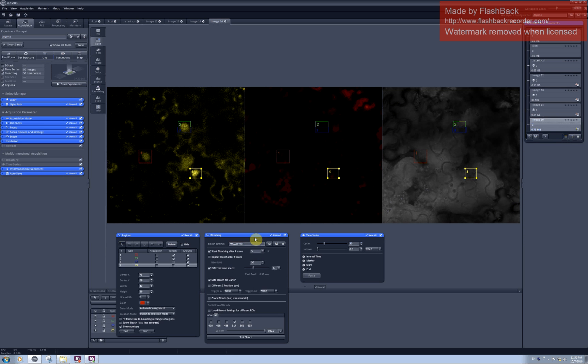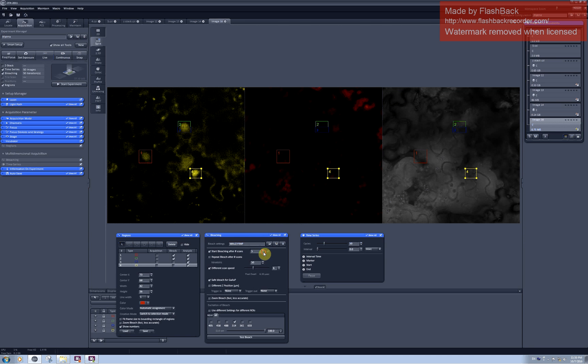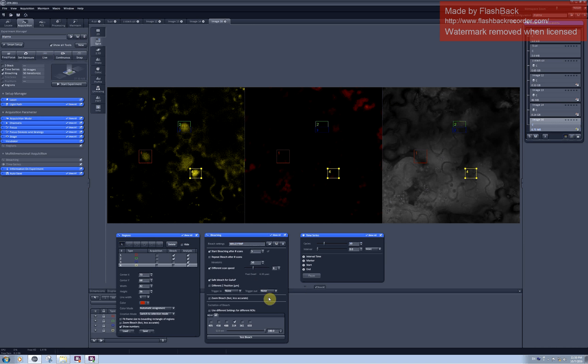In the bleaching menu the software will ask you first about how many scans would you like to perform before you start the photobleaching. And usually I use three or five frames depending on how sensitive my fluorophore is to scanning. You can repeat photobleaching after several scans but now I will run only one time photobleaching.